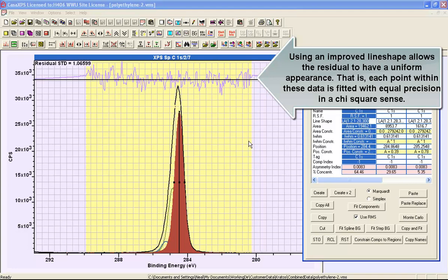So this represents an example of a peak model that is illustrating the underlying nature of an asymmetric peak for a polymer, polyethylene.